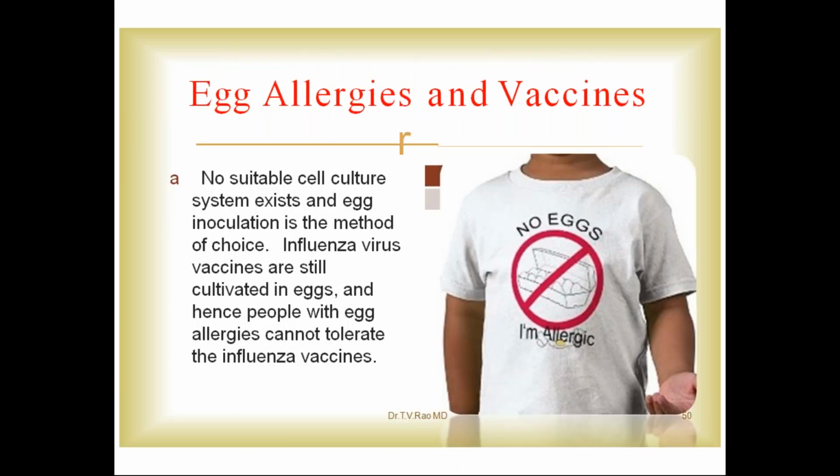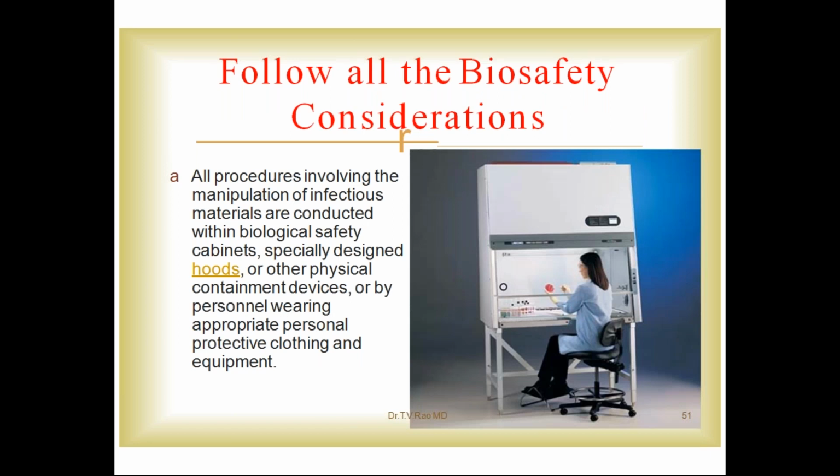Sometimes the vaccines are not useful because people are allergic. We should not give them to those who are allergic to eggs. We have to follow the biosafety procedures for growing and preparation of the vaccines. See, this is nothing but egg inoculation: how the viruses will grow in the various sites of the embryonated hen's egg. We have to follow all these sites for growing the vaccines in the embryonated hen's egg.